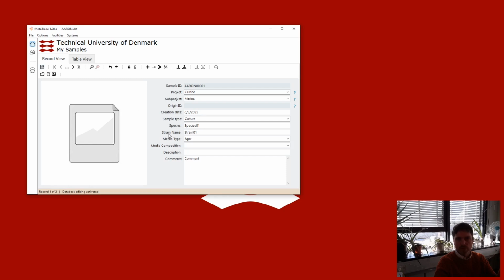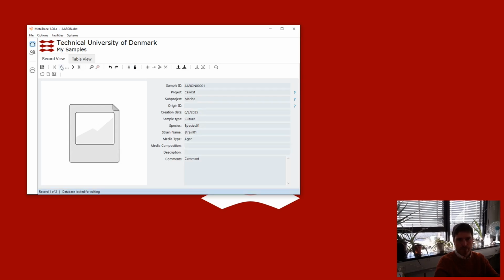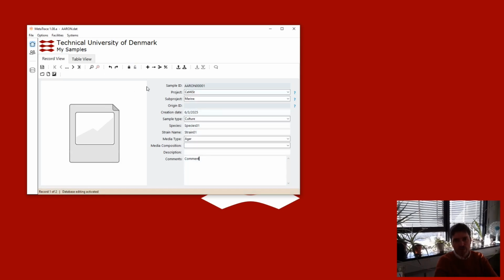So even if we save now, the assumption is that it's still unlocked, it's still editable, so therefore there's still something that you've probably changed that you may want to save as well. So the only way to fully save things is to lock and then save. So that's to make sure your edits that you've made will actually be saved. If it's unlocked and you make edits and you save, it's going to save those edits, but yeah, it's still going to think that there's some editing going on because it's unlocked.